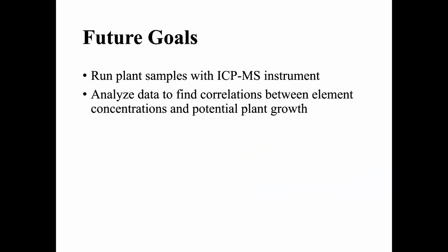As for our future goals, we are to actually run the samples through the ICP-MS and to analyze the data and find correlations between element concentrations and potential plant growth.